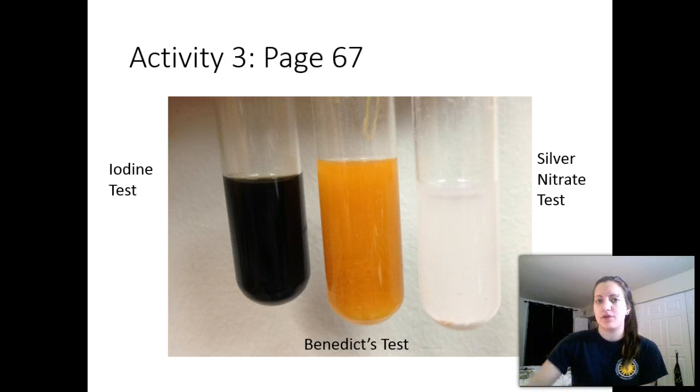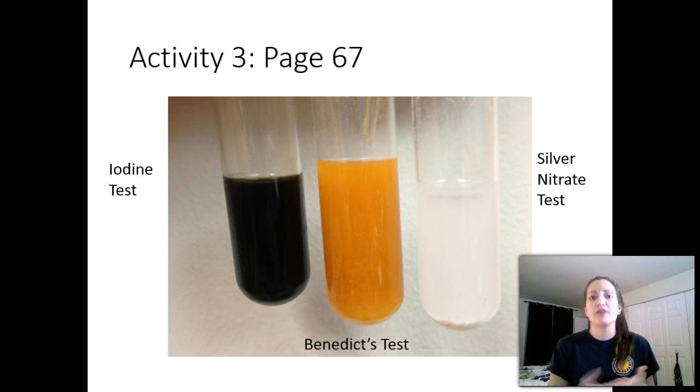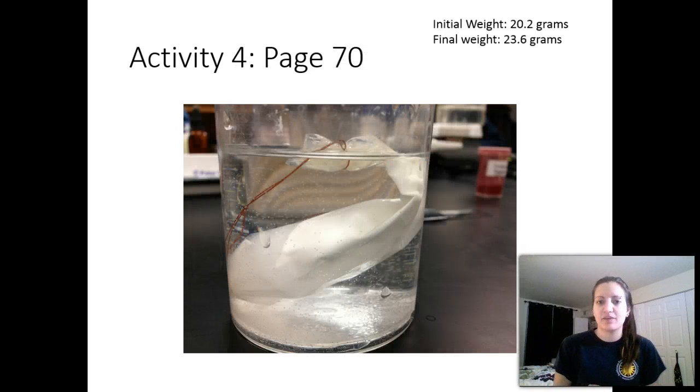So now that you know how to run these tests, we can now test the water left by the dialysis bag. So let's say this dialysis bag has now been sitting in the water for 20 minutes. So anything that was going to move, let's say, has moved. So if starch or glucose or salt was going to move, it's moved at this point.